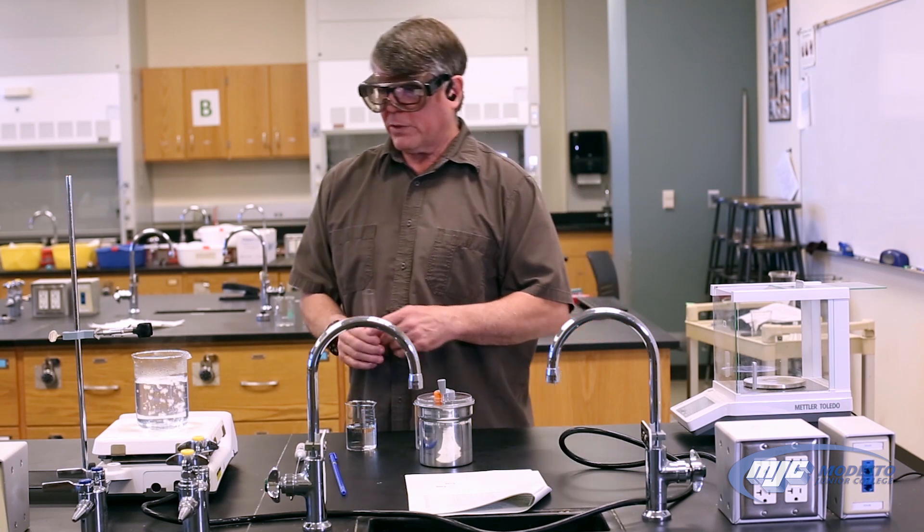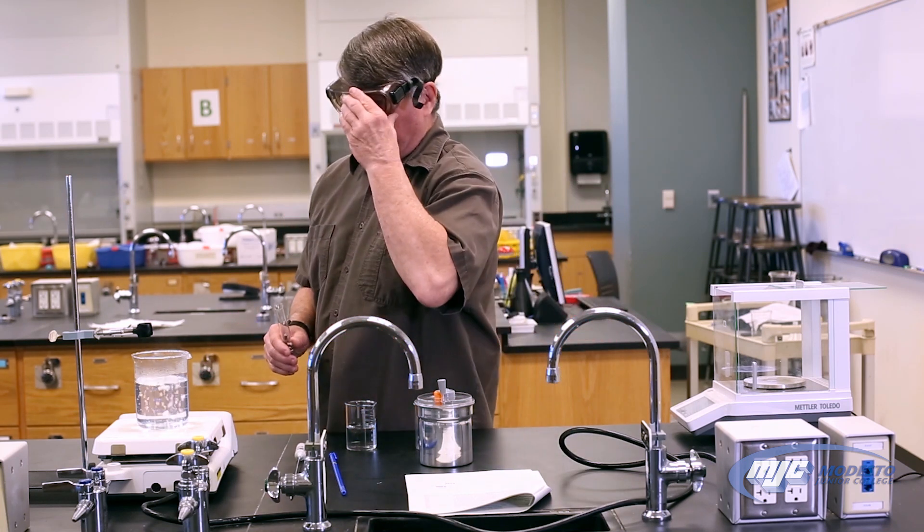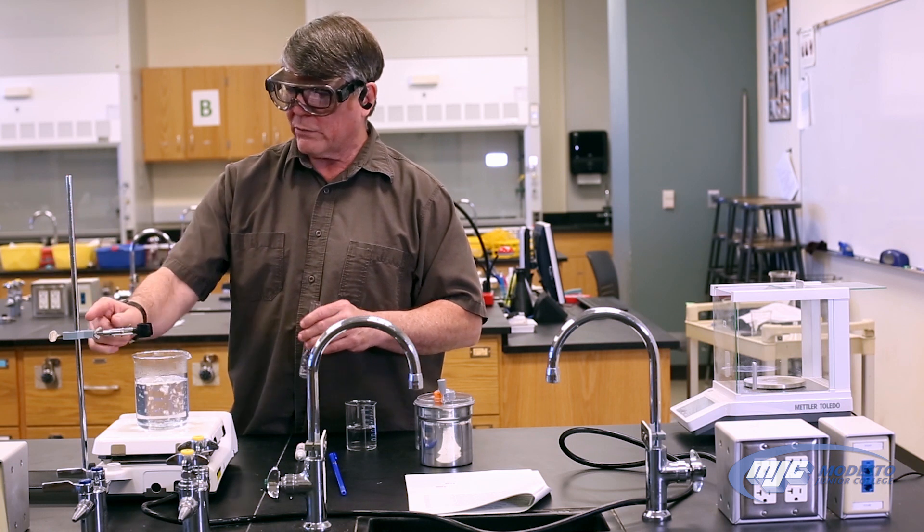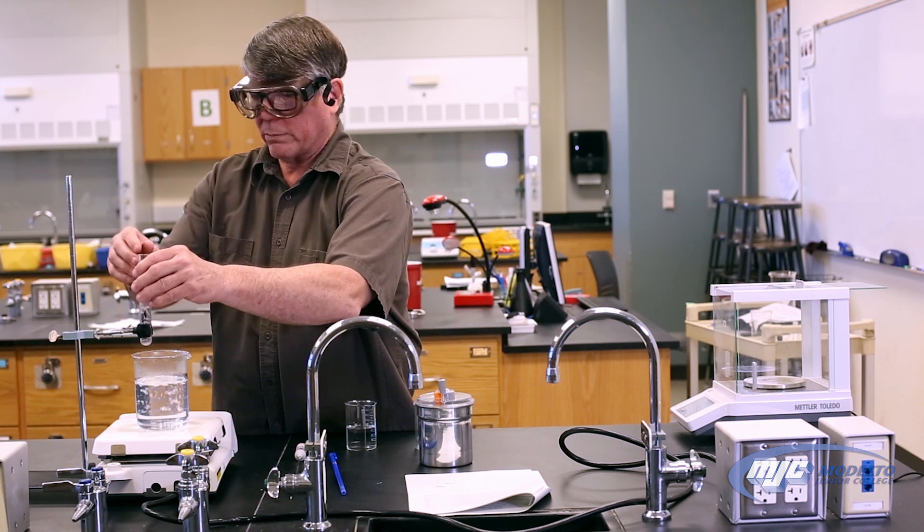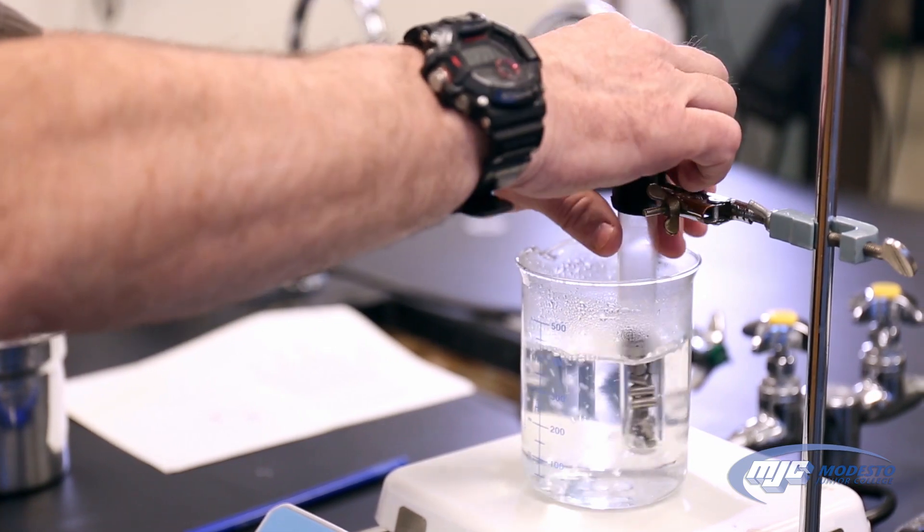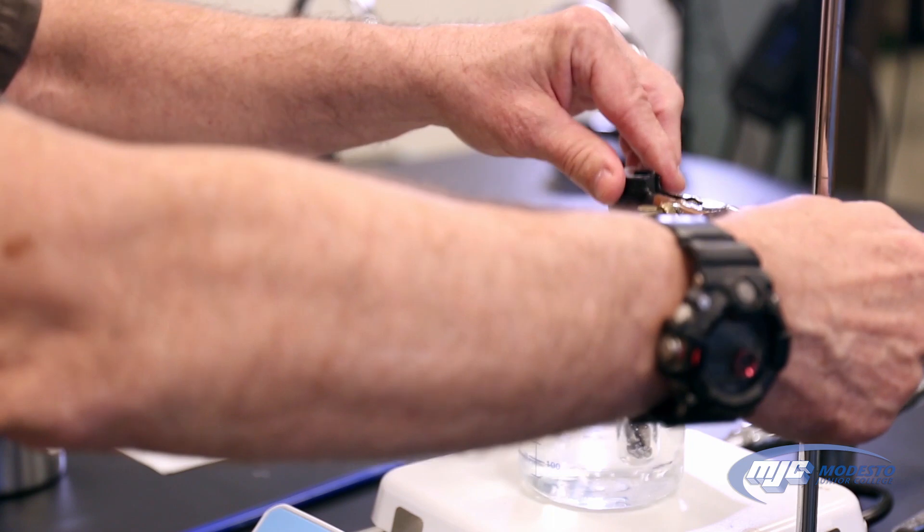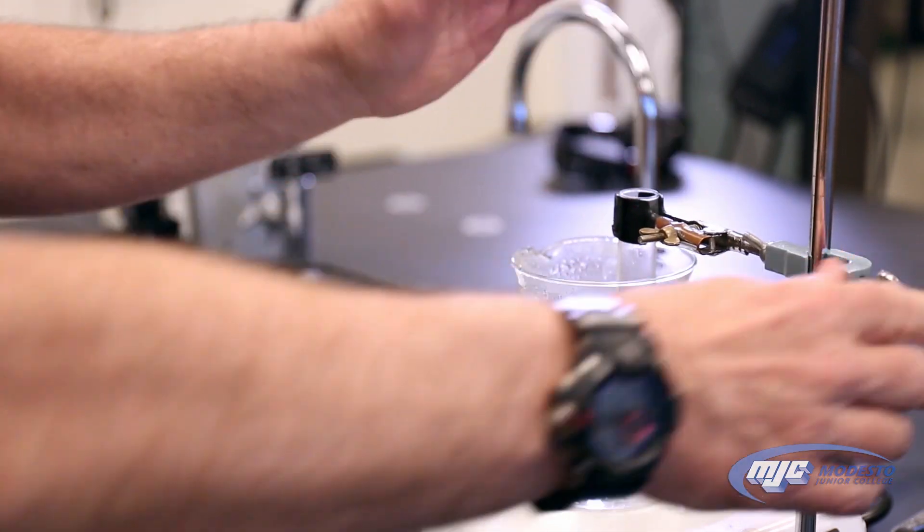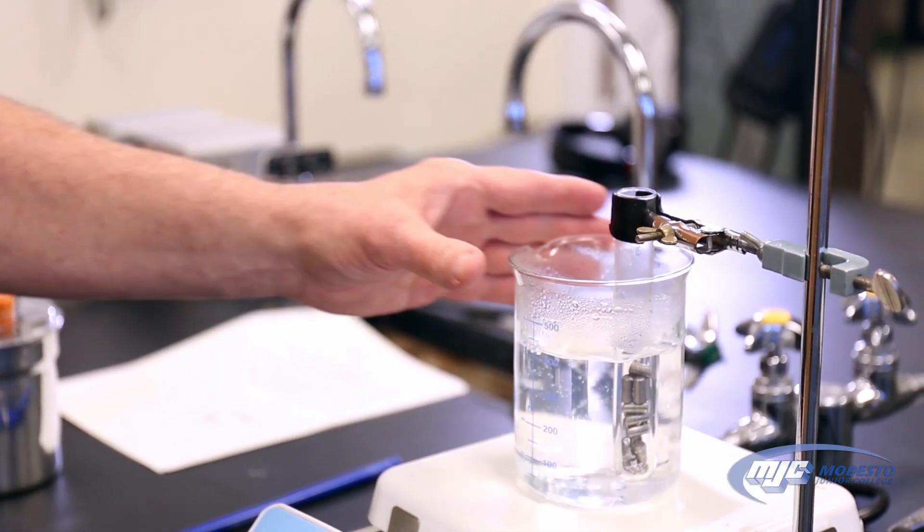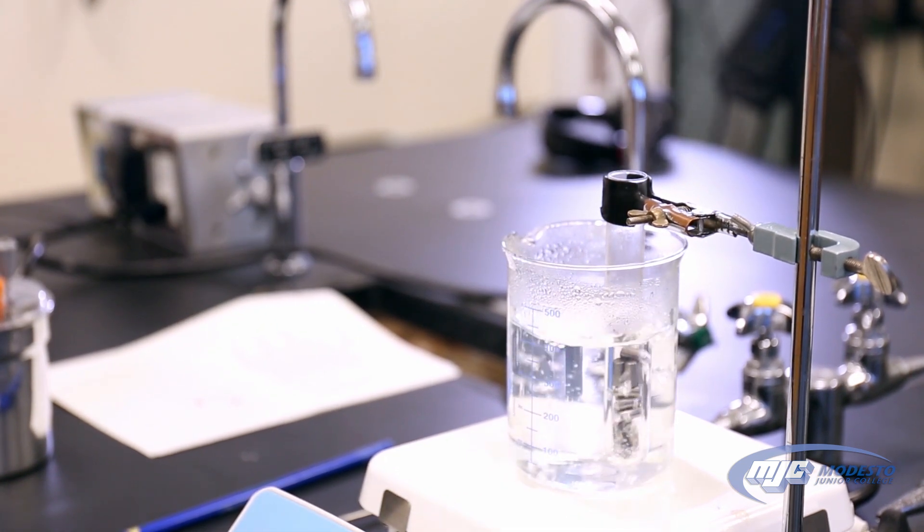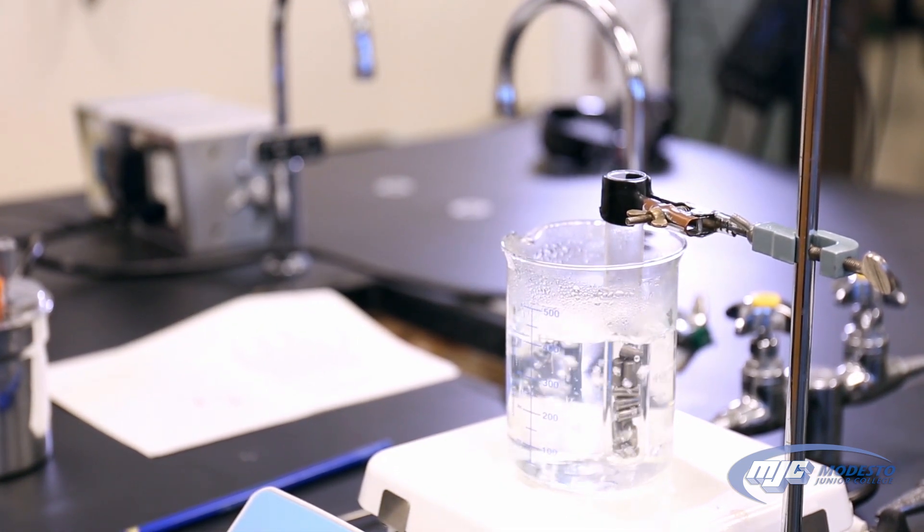And now what we're going to do is we have a beaker of boiling water over here on the hot plate. We're going to take a ring stand and a clamp and clamp the metal into the boiling water. All the way down. Submerge all the way down. Clamp it on here. And then lower it down. We don't want to touch the bottom of the beaker but we want to get it all the way submerged. Now we're going to let that sit over there and heat for a while while we take a couple of other measurements.